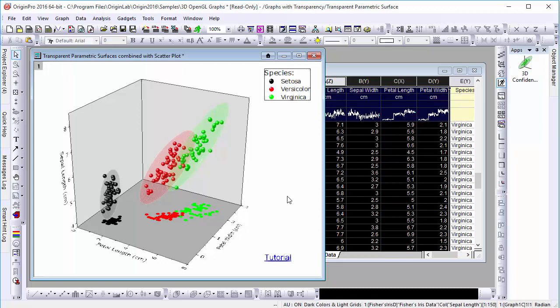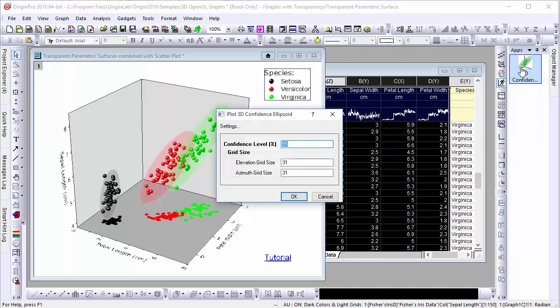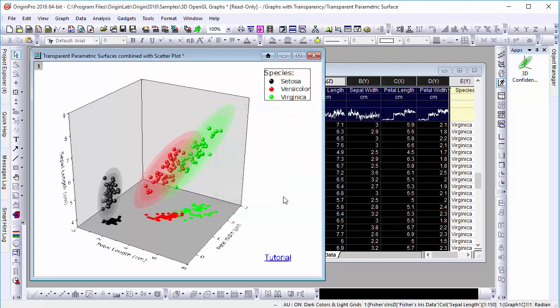As you can see, three semi-transparent ellipsoids were generated for our three corresponding species. Now, let's go back into the app and try this once more, changing the confidence level to 99%.